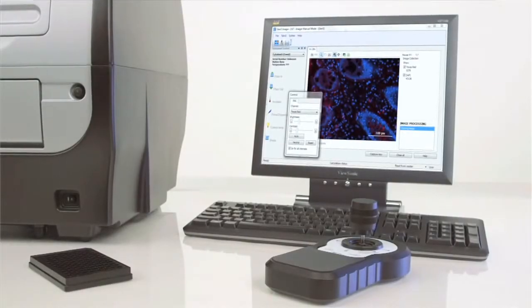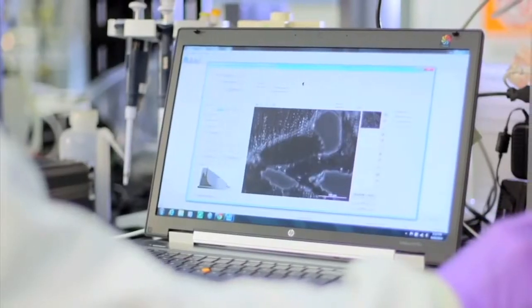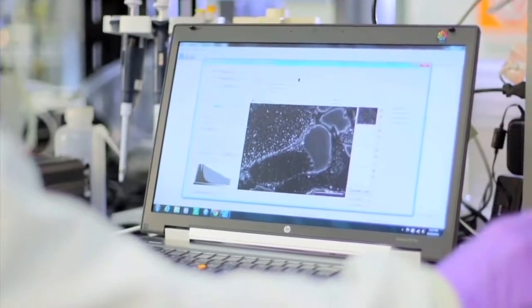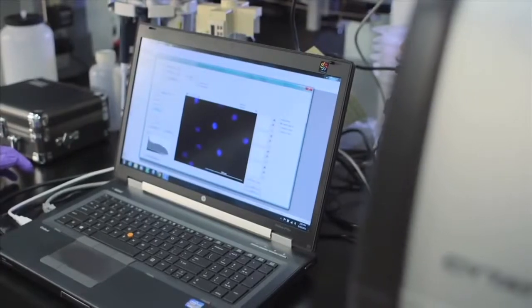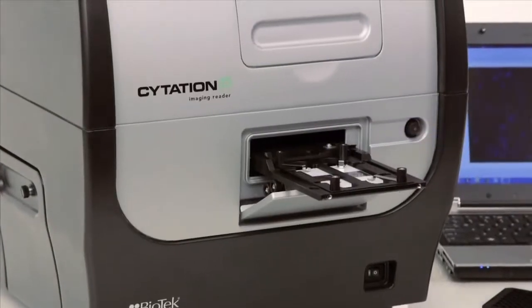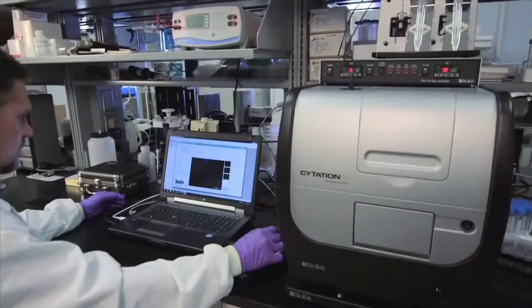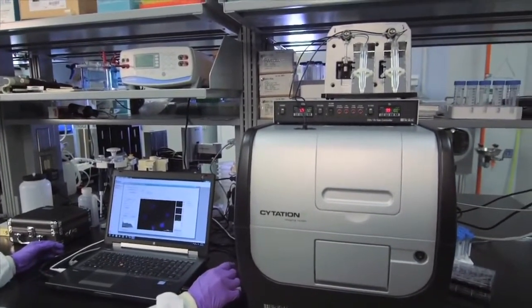Unlike complex image analysis software interfaces, Gen5's interface is specifically designed for users at all levels and requires minimal training. Image acquisition, processing, and analysis has never been easier.